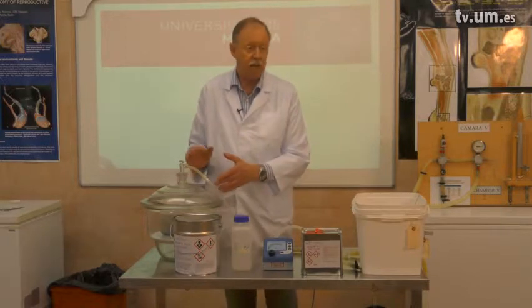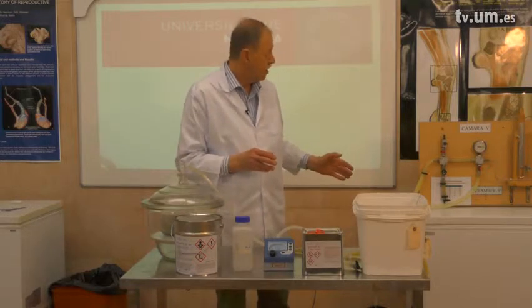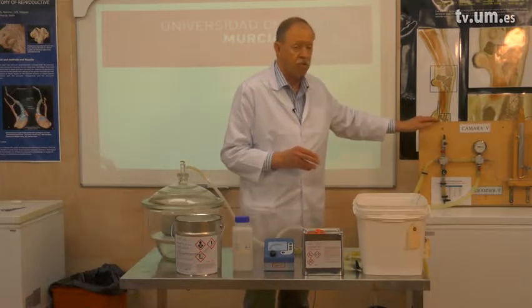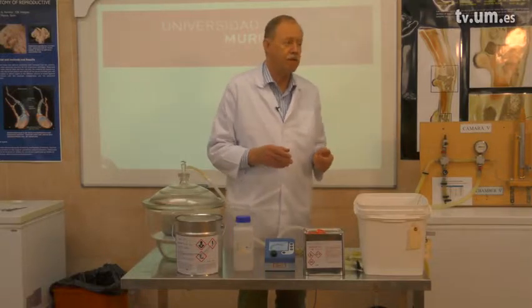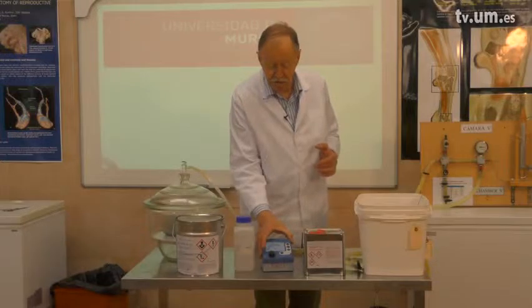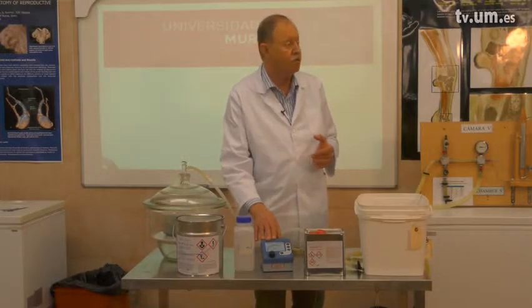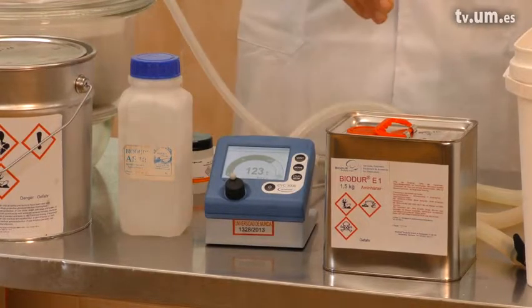The vacuum chamber is connected to a vacuum pump — it's standing here on the floor — and to a vacuum regulation unit that is here with bypass valves and a manometer. Here we have an accurate digital manometer to watch the amount of vacuum that we apply.